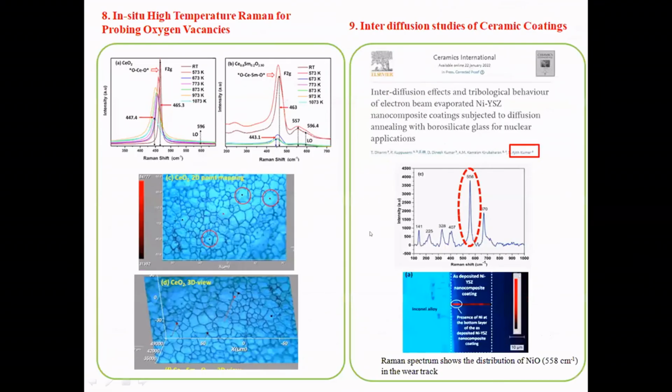And of course, this high temperature data, what we are having like cerium oxide, it's a highly doped structure, heavy, so highly influenced by the high temperature, like more than 300 to 400 degrees Celsius. So you can see the formation of vacancies. Because it's an aliovalent doping, it ends up with a lot of oxygen vacancies that are all sensitive to the photonic scattering. And the distribution of them throughout the microstructure, with which grain or which boundary the vacancies are sensitive, you can map accordingly. So these techniques are highly useful to understand the behavior of the sample.